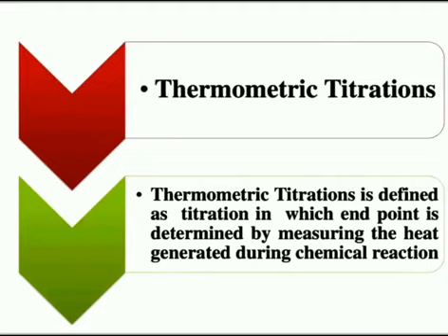This titration involves the measurement of change of temperature of a solution during the titration as a function of volume of the titrant added. So therefore, we know what thermometric titration is: a titration in which the endpoint is determined by measuring the heat generated during a chemical reaction.